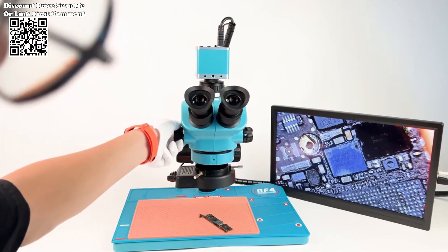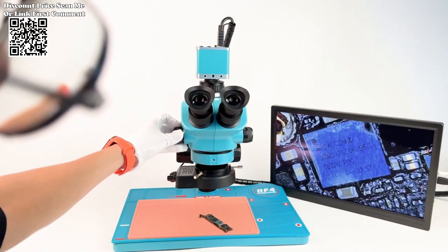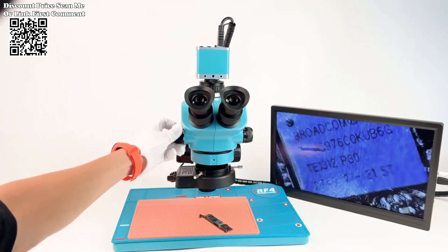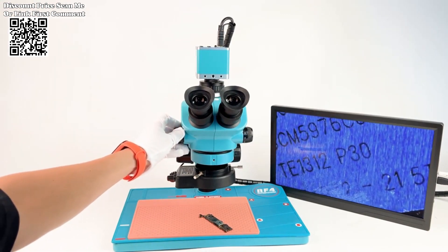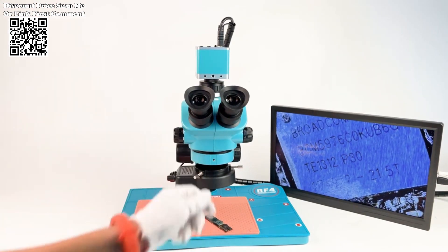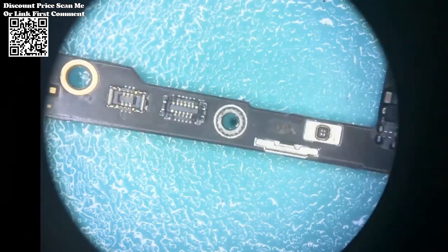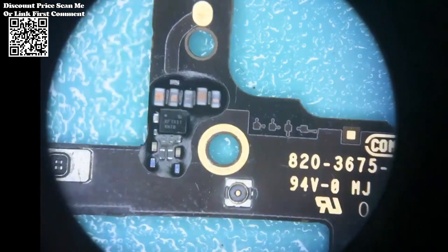In the realm of microscopy, precision and clarity are paramount, and the RF4 Neutronocular Microscope Head, available on AliExpress, sets a new standard in optical excellence. With its advanced features and upgraded electronic eyepiece, this microscope is a game-changer for professionals and enthusiasts alike. Let's delve into its impressive capabilities and specifications.